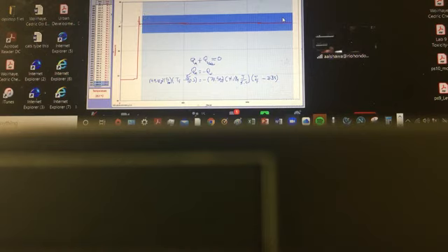So avoid something that has kinks and features that are artificial due to somehow touching the metal suddenly with that temperature probe or something that you've done. Just locate the area which is a smooth descending temperature. But it has to be the most linear portion of that plot. So I highlight that most linear portion of that plot.